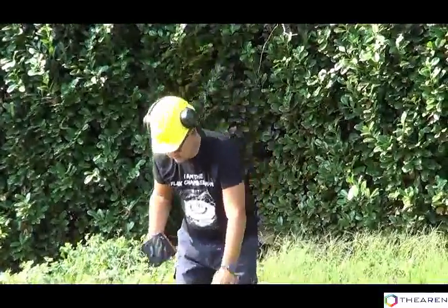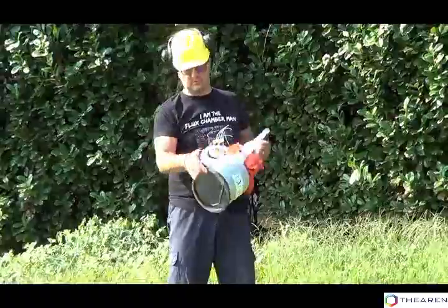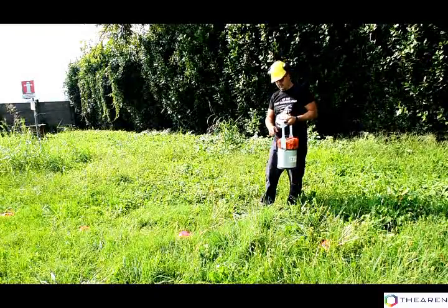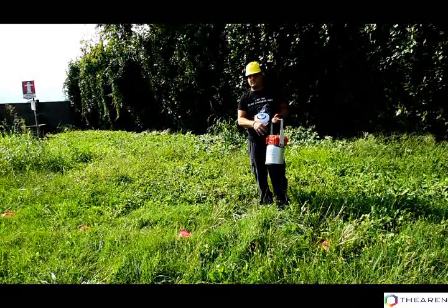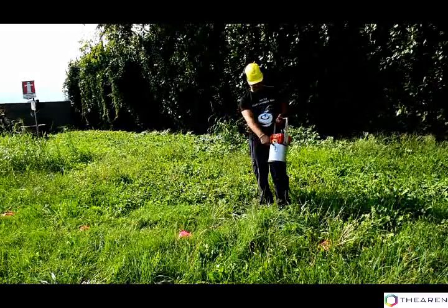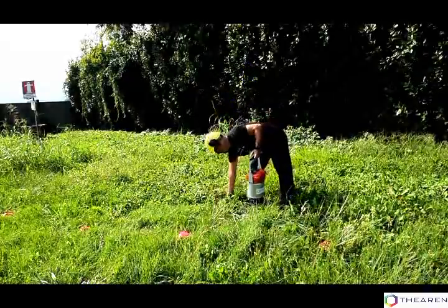A static accumulation chamber is a device that allows the measure of emission rate from some specific compounds, without introducing a gas carrier. The system works by accumulating the vapor inside the chamber and measuring the concentration trend of carbon dioxide, methane, total VOC, and H2S. A small pump takes the gas from inside the chamber and sends it to the sensor, which then reinserts it into the chamber. Under these conditions, the concentration of the monitored parameters increases over time with a linear law.